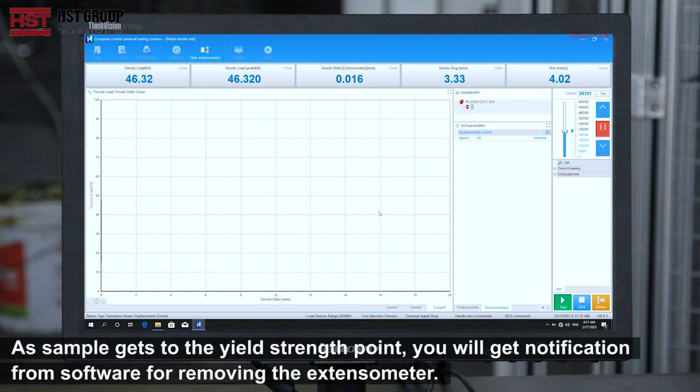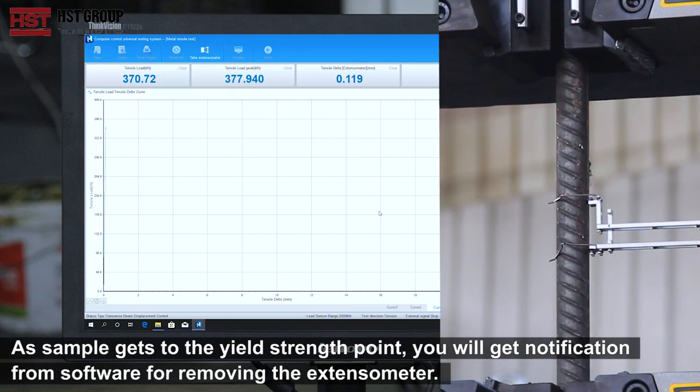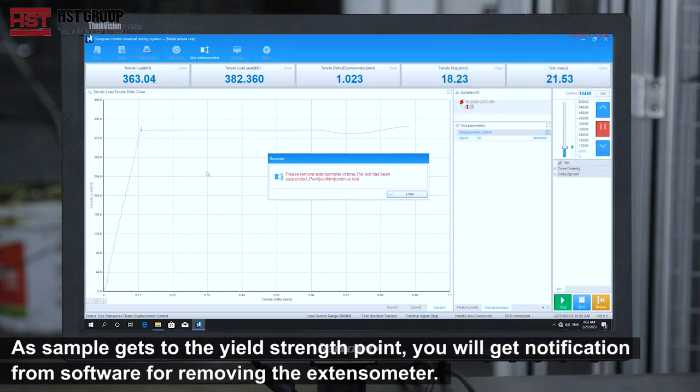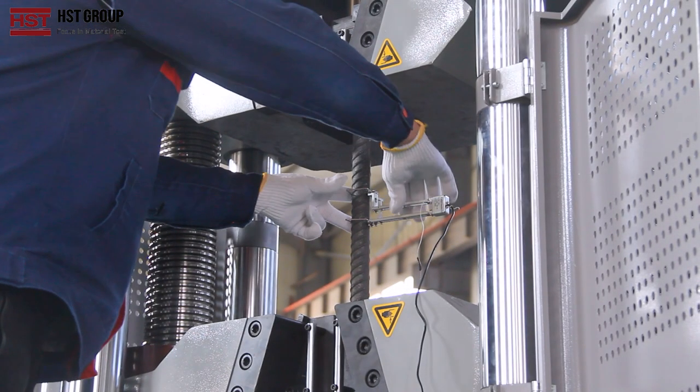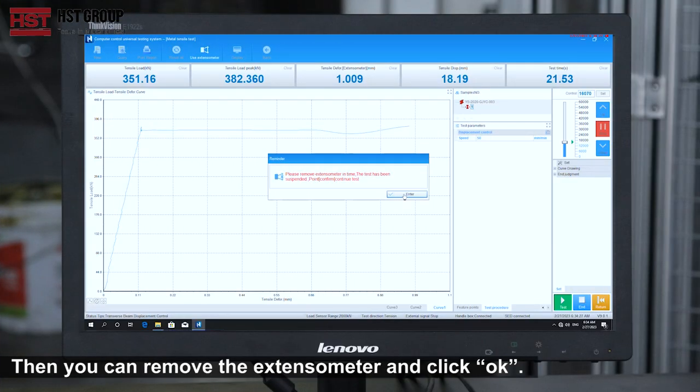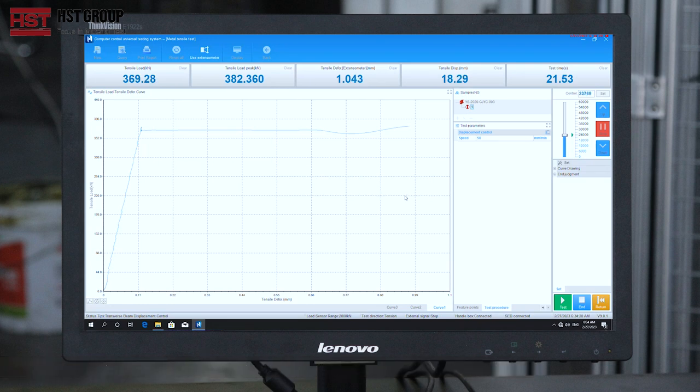Step 6: Start the test. As the sample reaches the yield point, you will receive a notification from the software to remove the extensometer. You can then remove the extensometer and click OK.